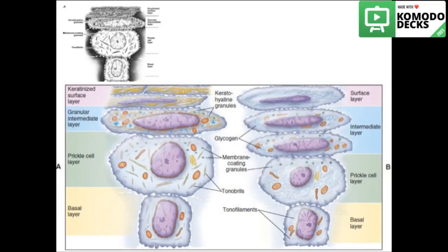The keratinized epithelium is composed of a basal cell layer, which are cuboidal cells that are least differentiated and undergo mitosis to progenerate keratinocytes to the upper layers. Next is the prickle cell layer containing tonofilaments and start of granules.